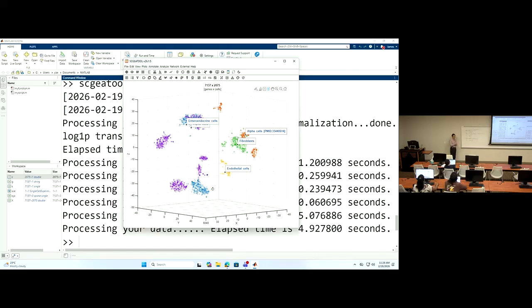Okay. Yeah. If you have your own curated marker genes, can you create your own database? Yeah. There's a place where you can do that. Okay, I have a list of marker genes. This special cell type nobody has ever studied. It's not in the database. It's fully customized. Let me see where the function is. So there's annotation. So you see annotation.